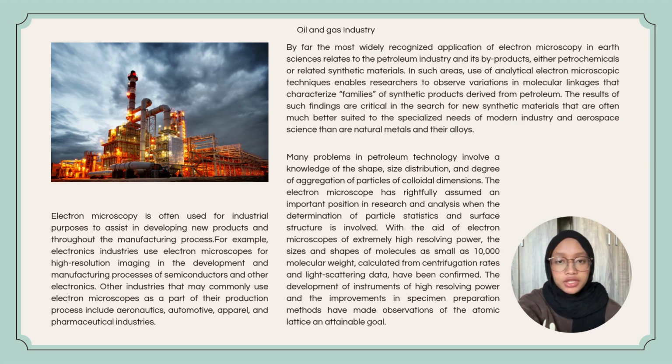pharmaceutical industries. By far the most widely recognized application of the electron microscope in Earth science is related to the petroleum industry and its byproducts, either petrochemicals or related synthetic materials.